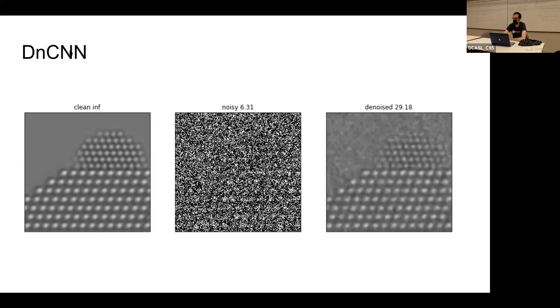Something else that you said that is very interesting is that you can see where the edge structure is, and then maybe you can use that to denoise better. That kind of methodology was actually what people used to do before neural networks. Apart from wavelet denoising and Wiener filtering, there are also other nonlinear approaches where people would say, I see my edge structure, so why don't I do local averages that are adaptive to that structure? Those were some of the state-of-the-art approaches before neural networks. And we'll see in a moment that what the neural network actually does is kind of related to that, interestingly.